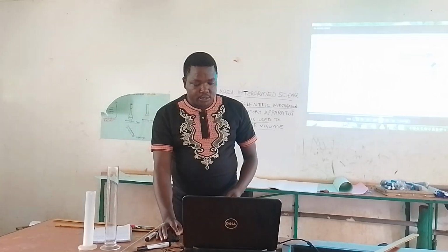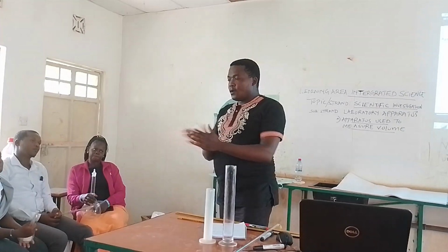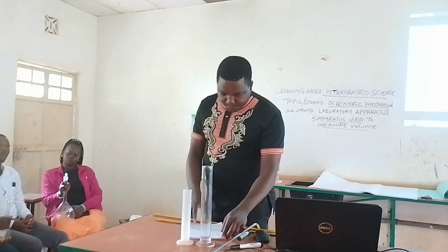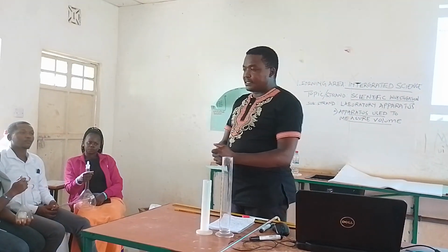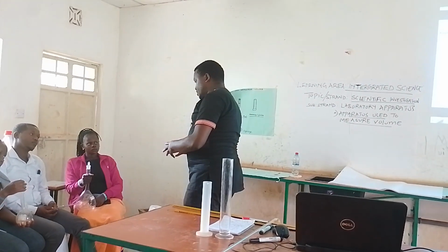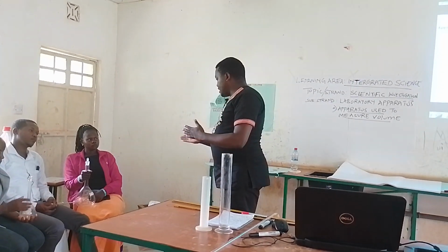Yes. Now, those are some of the apparatus that we are going to be using from now up to the time we are in grade 9. Okay. So, now you have shared with your friends some information about those apparatus. Now, you can remind me of the names of the apparatus to check whether we are able to identify them. Can we start here?